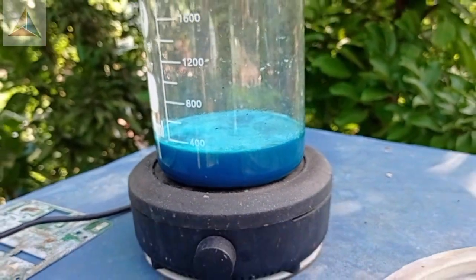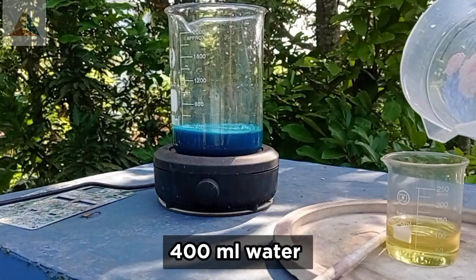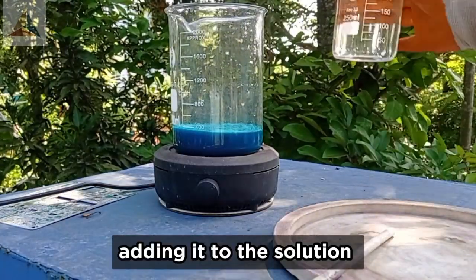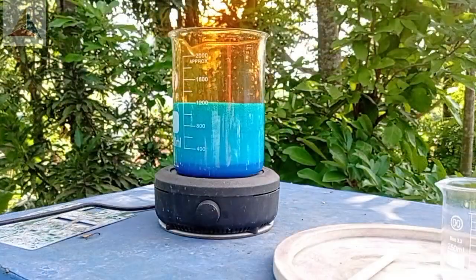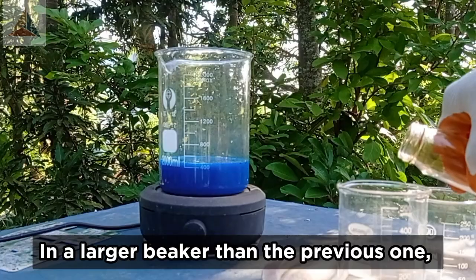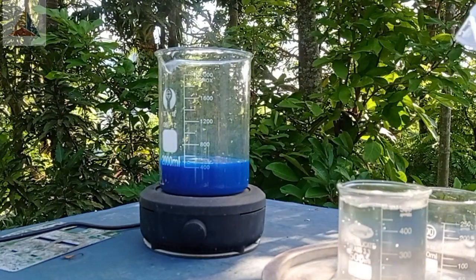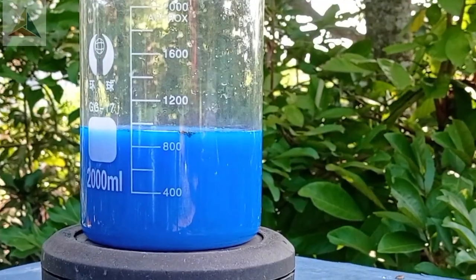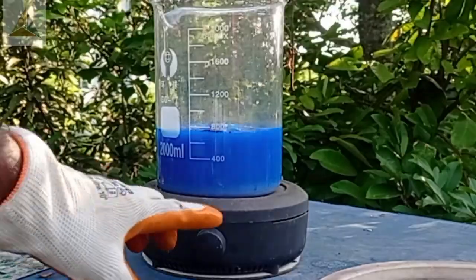After another hour, again taking 200 ml HNO3. In a larger beaker than the previous one, I'm taking 200 ml HNO3 and 900 ml water, adding it into the beaker. Ensure that all relay contacts are dissolved before turning off the stove. I'm turning off the heating plate.